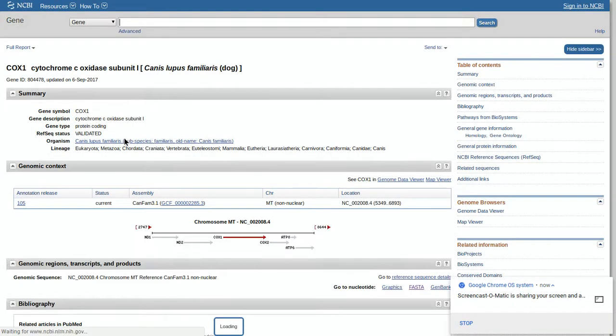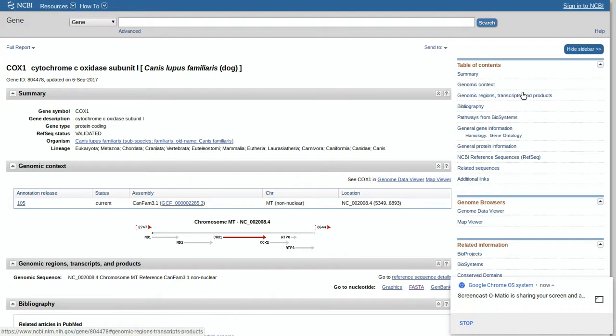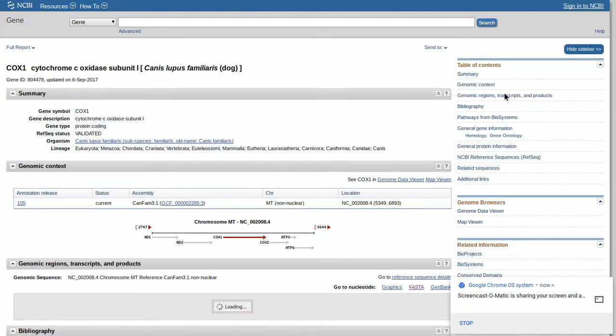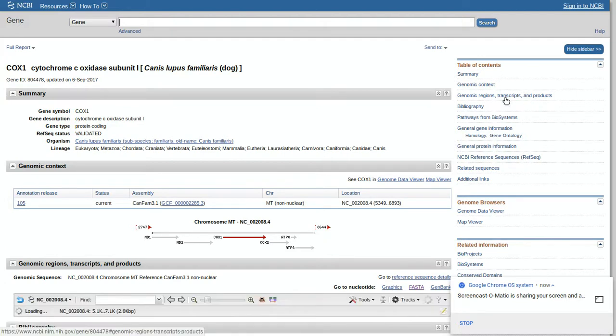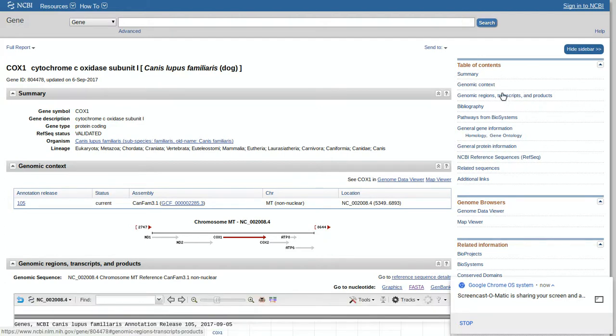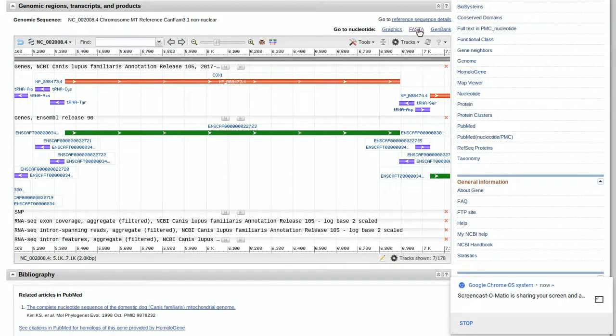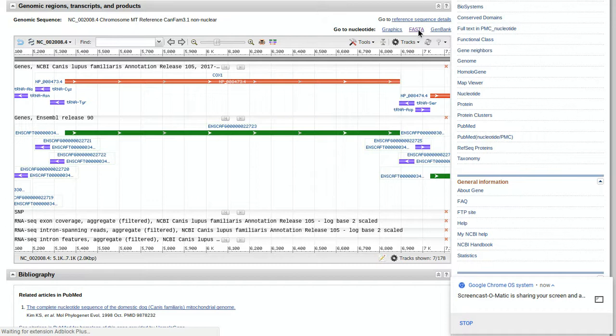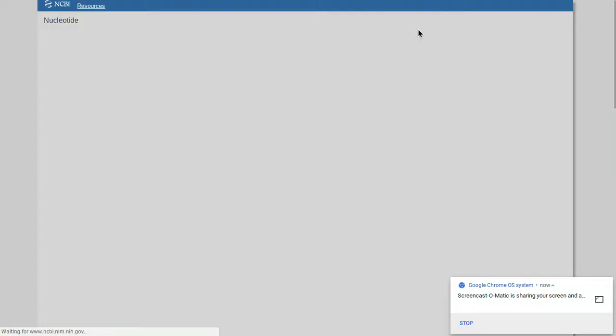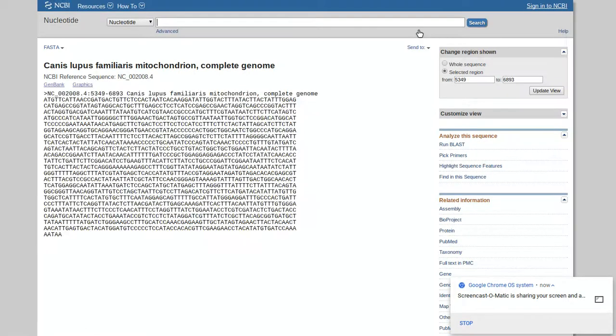Now you go to the right. Under the context, select genomic regions, transcripts, and products. Once you're here, you select FASTA (F-A-S-T-A) under the nucleotide title bar. After you select FASTA, copy this code.